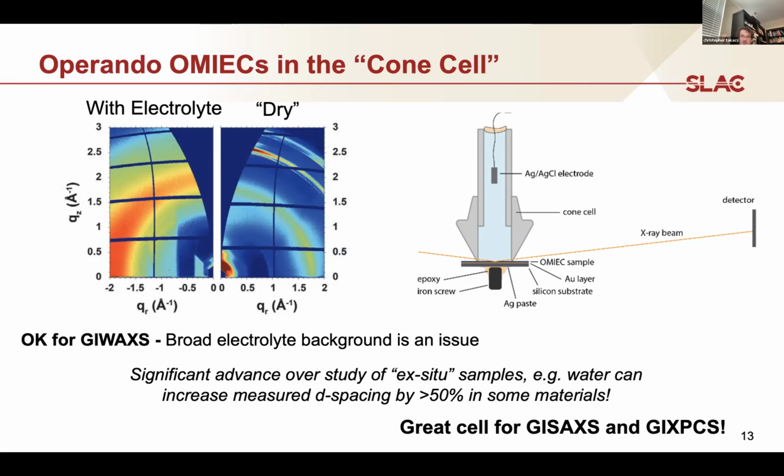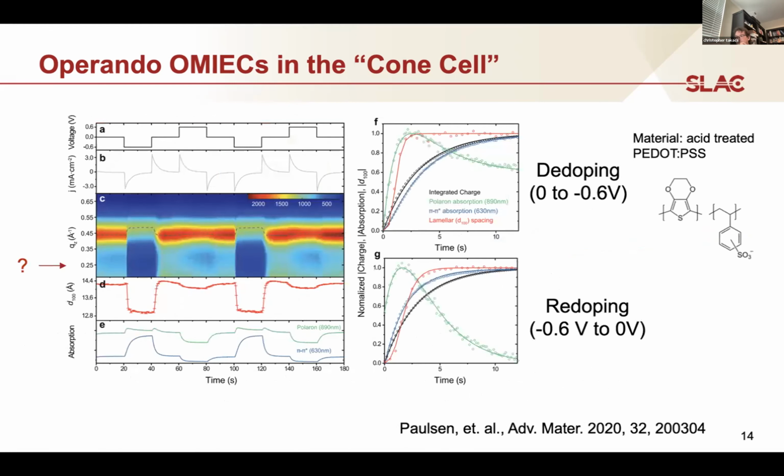You can do it, but you have to be extraordinarily careful, and you can make a lot of mistakes if you're not careful. So we were able to take these cells, combined with our precision electrochemistry, and do these experiments at the wide angle beamline at Sector 8 with Joe. We went through various pulsing schemes and looked at the structural responses. For example, we looked at the change in the measured D-spacing along with all of the diffuse structure at lower Q. Although at the time, I think we didn't really know what to make of that, I think now we have some more ideas about the context.